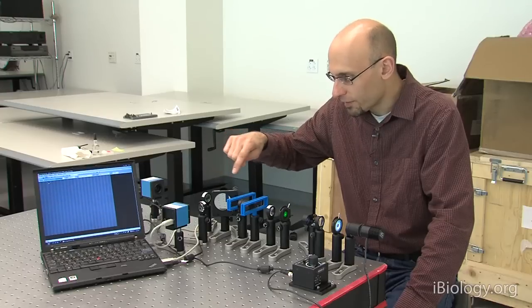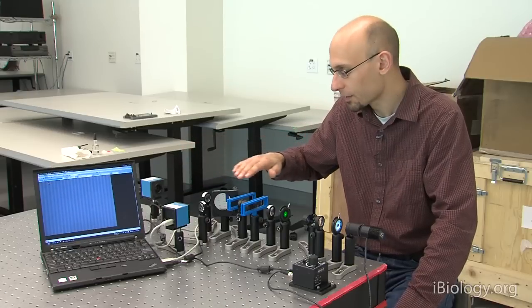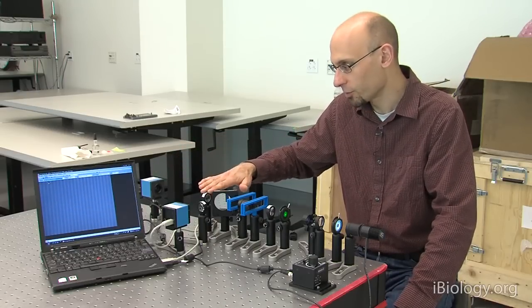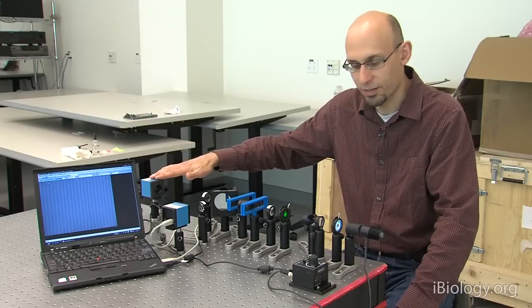Then one unique thing about this microscope, and the reason we built it this way, is we have a beam splitter here so that we have two different detection paths. The straight-through detection path here is a conventional microscope. This is our tube lens, and it images our sample onto the camera. So whatever is in focus in our sample plane here is in focus on our camera.